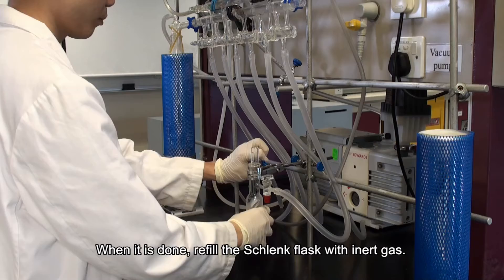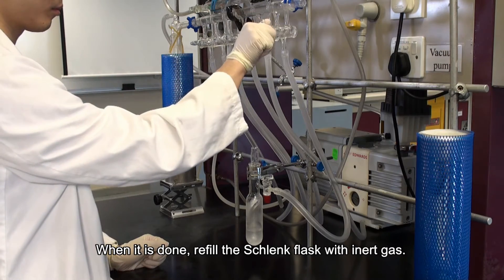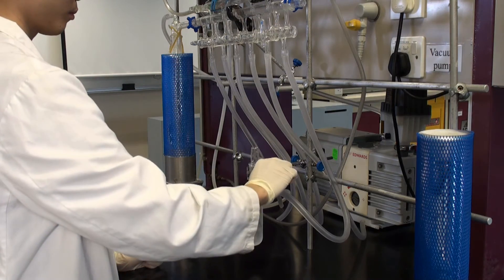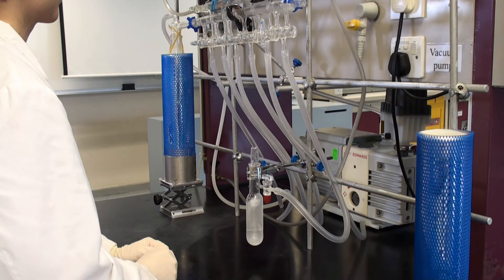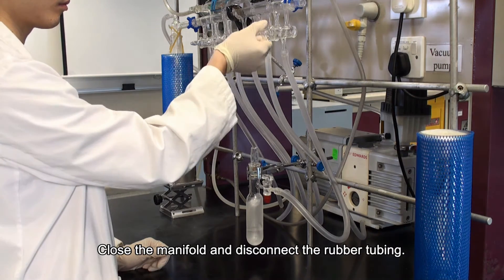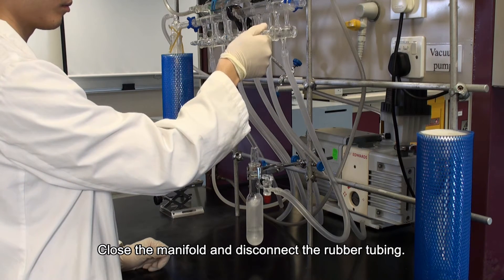When it is done, refill the Schlenk flask with inert gas. Close the manifold and disconnect the rubber tubing.